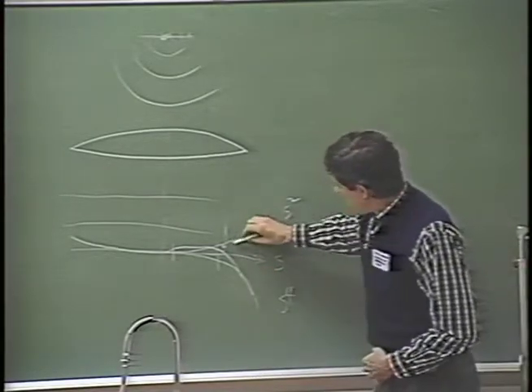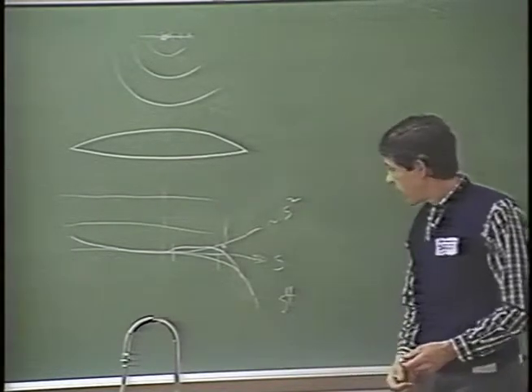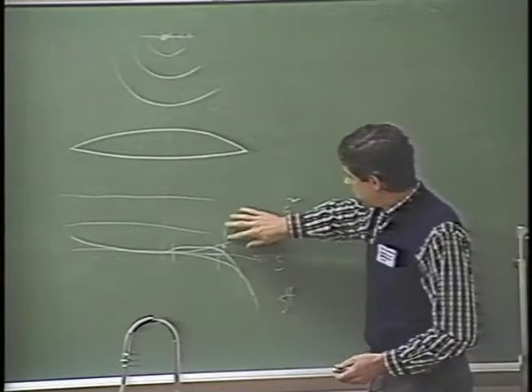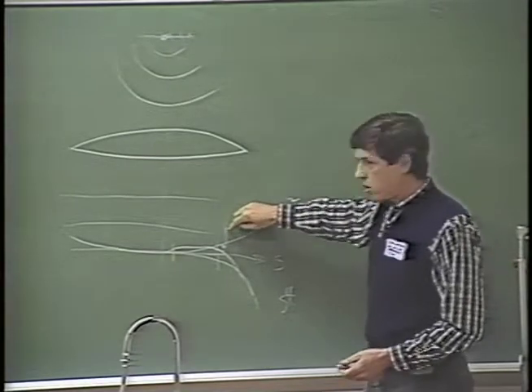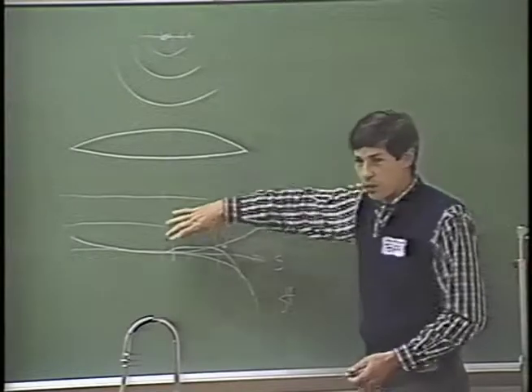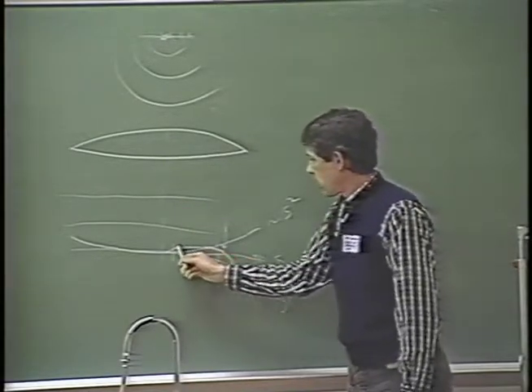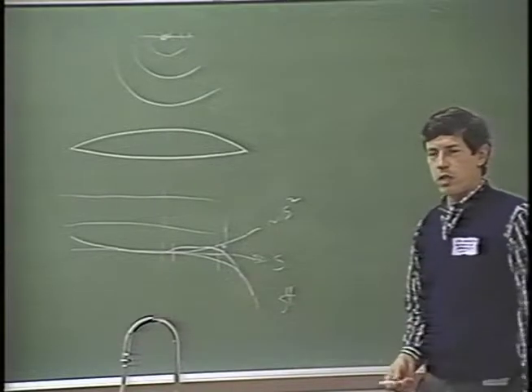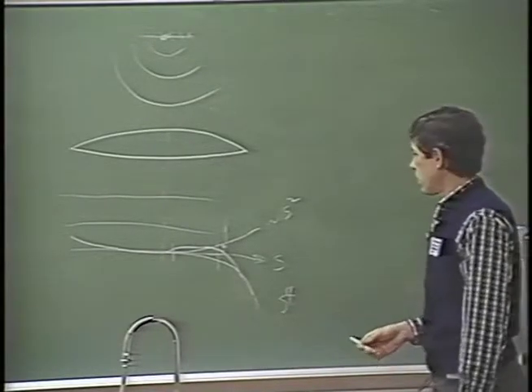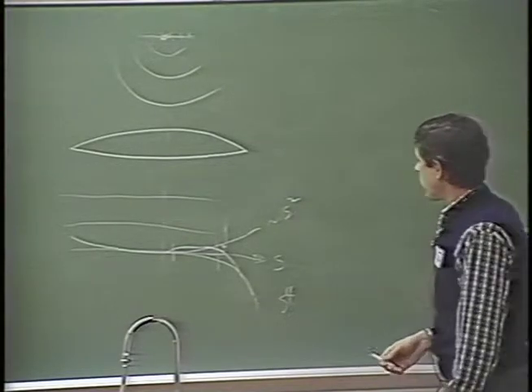That means out to some range of some resolution that's not as good as 3.5 angstroms, maybe 5 angstroms to 20 angstroms or so. In this region here is where you get good phase contrast imaging. So out to a limit of something around 5 angstroms.